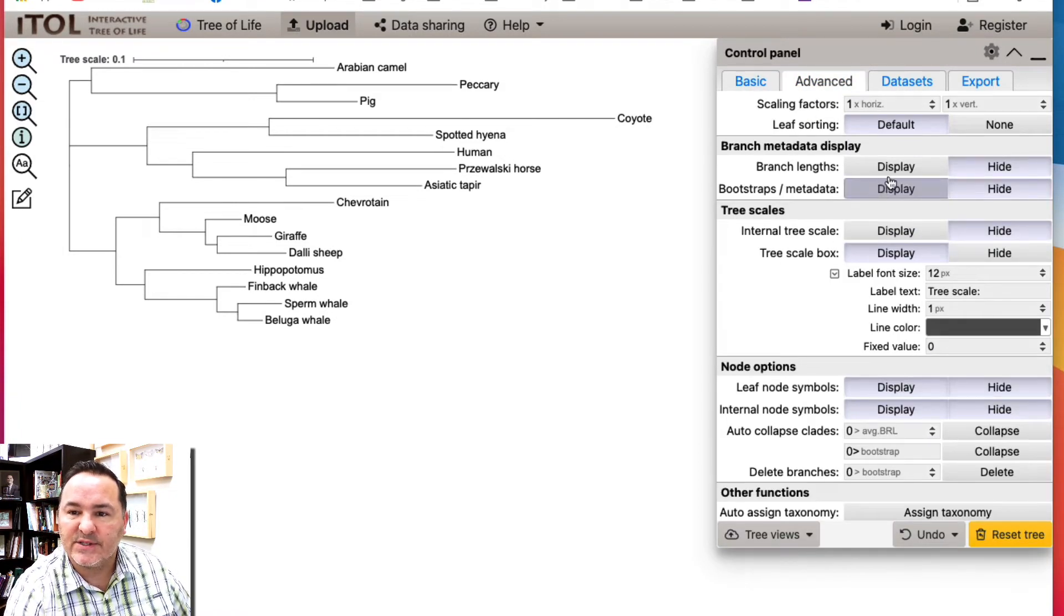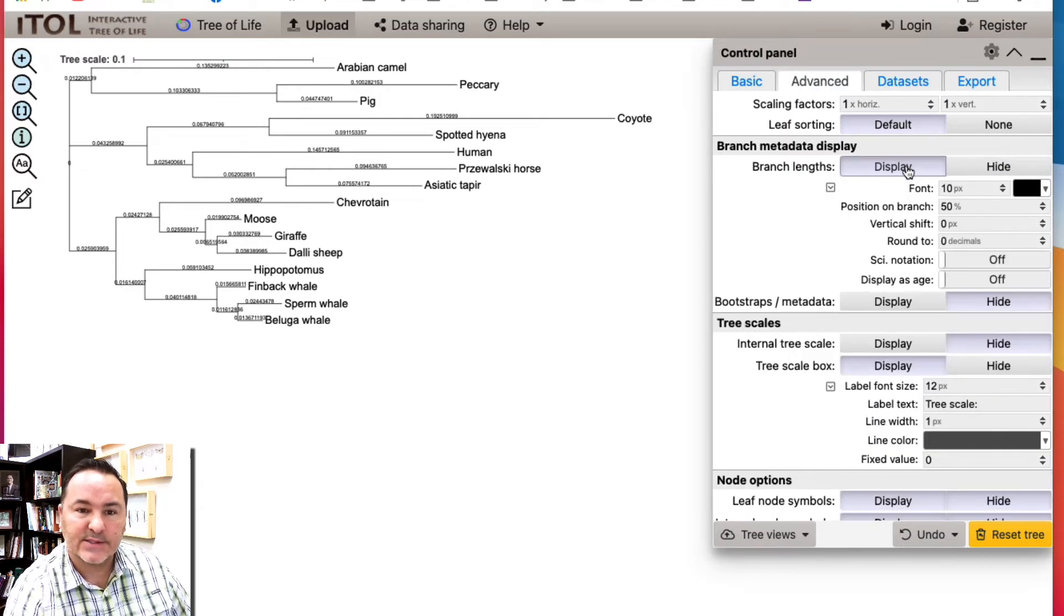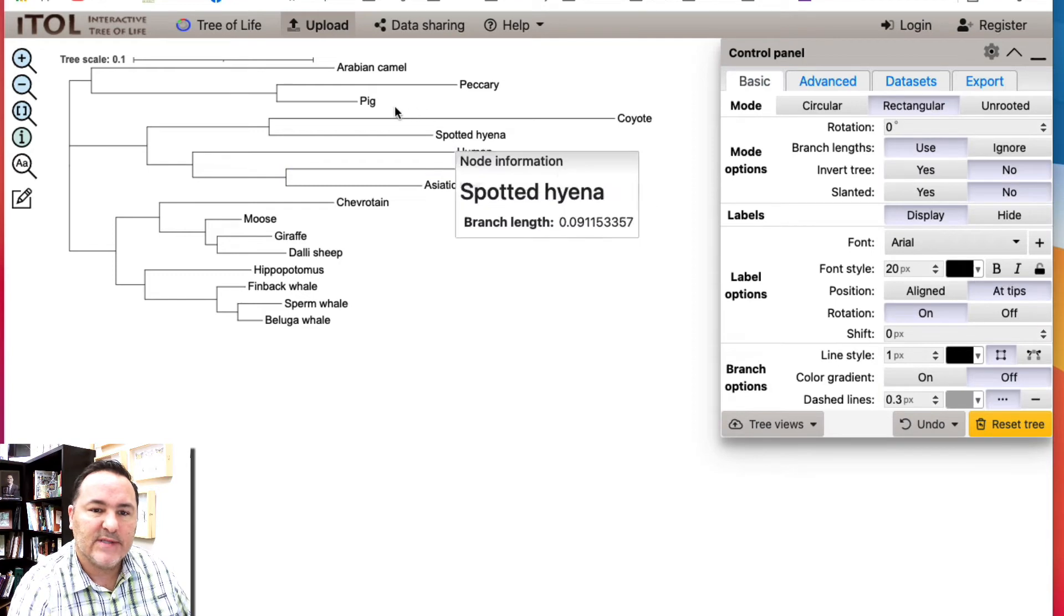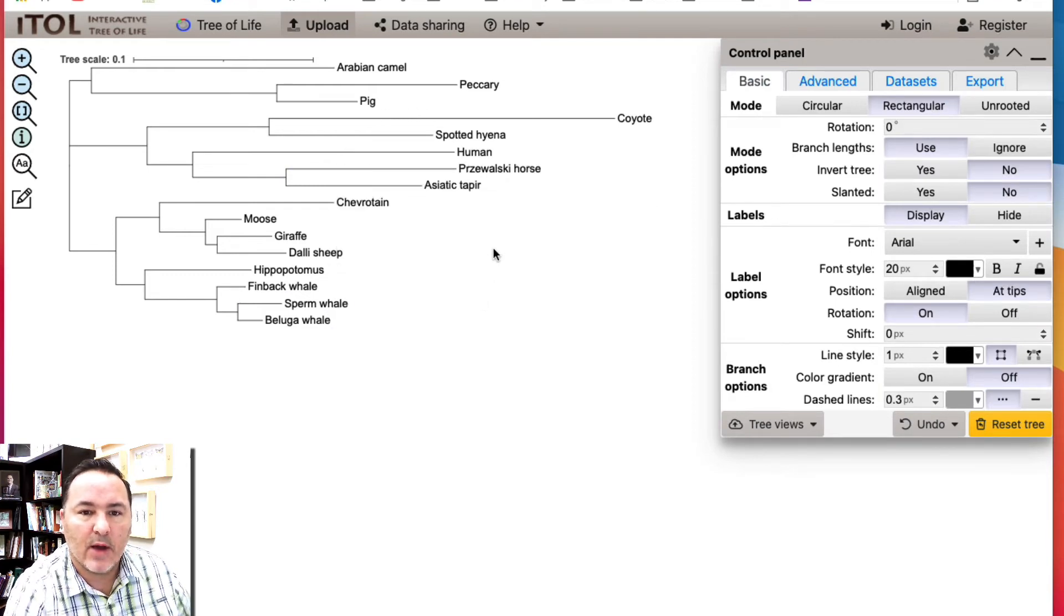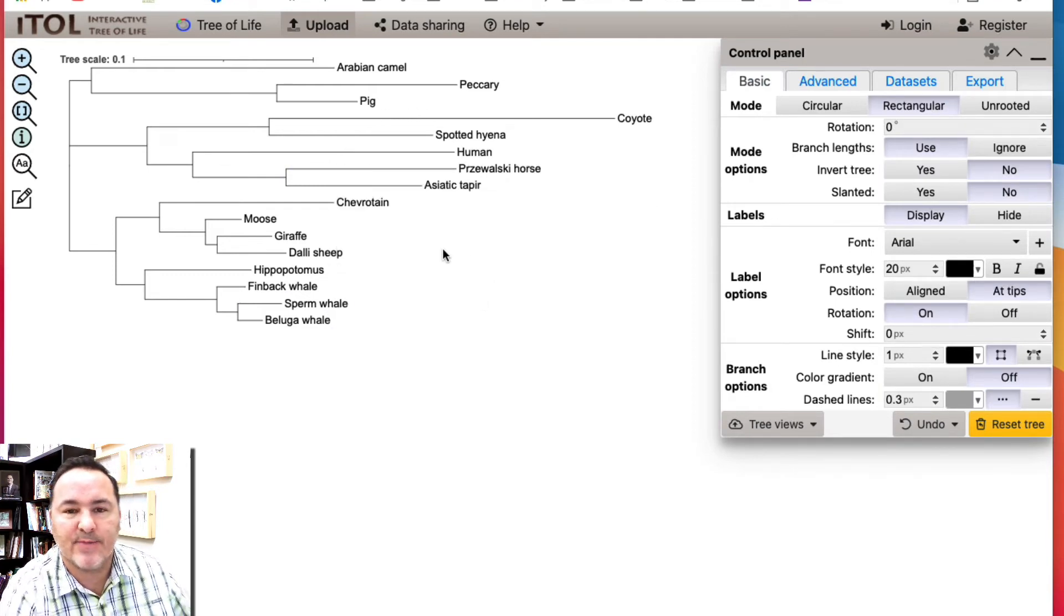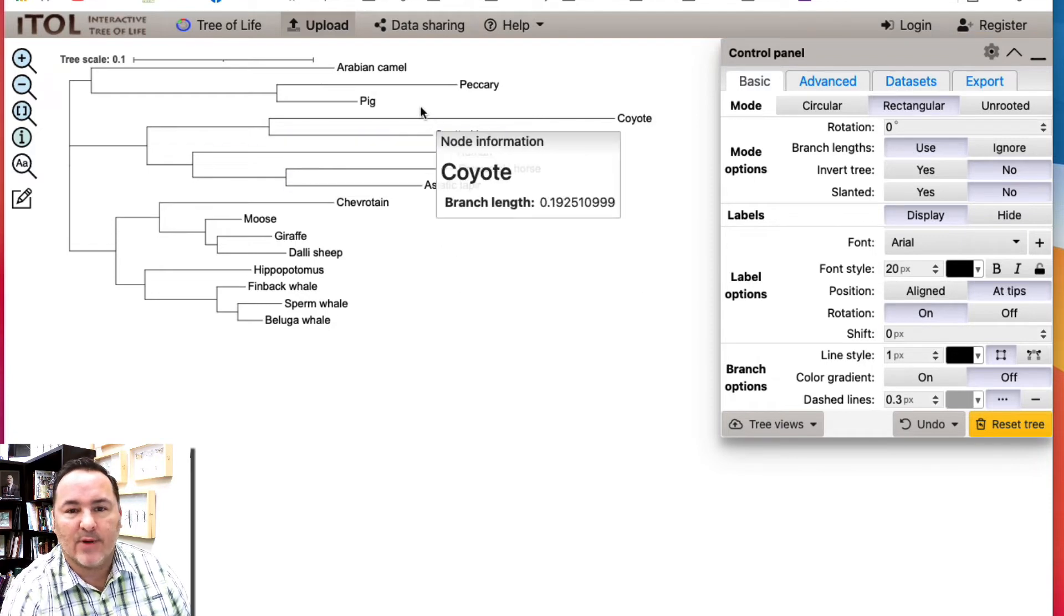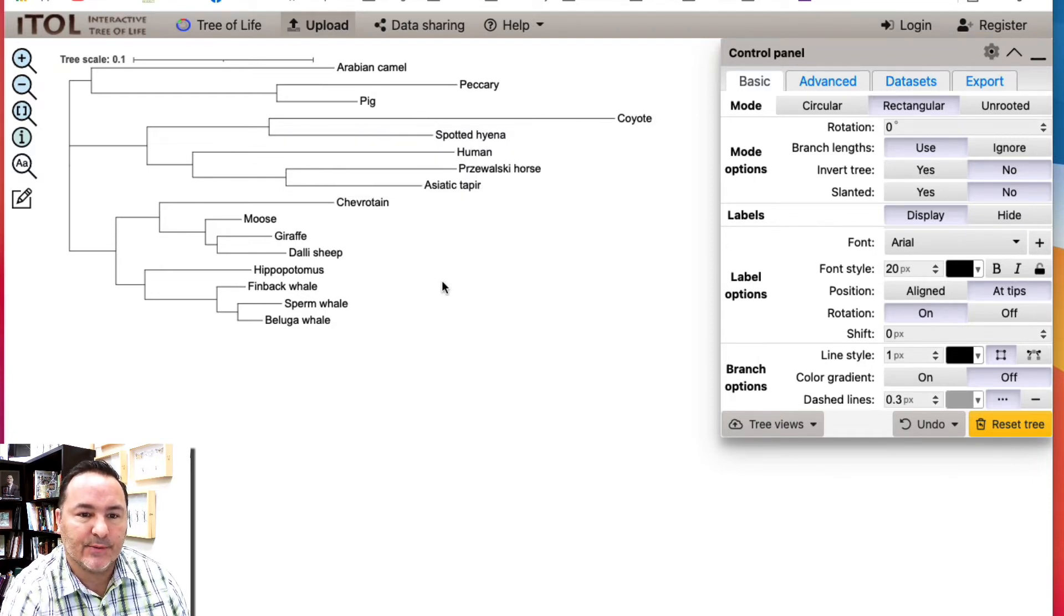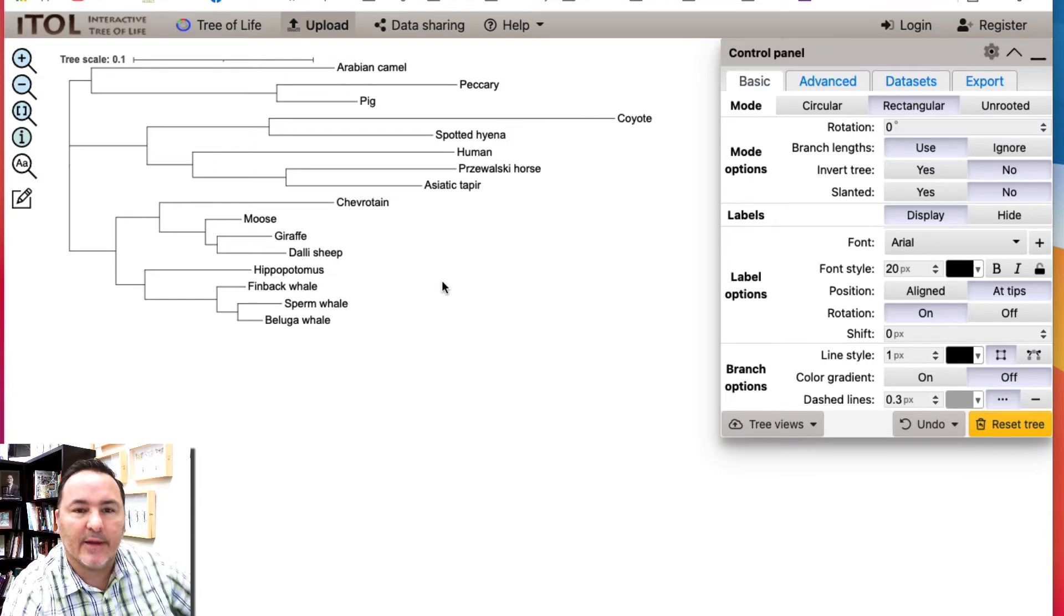We can display our branch lengths if we wanted. Let's say I look at this and I say, oh, I need to reroute this to my outgroup. Well, these are all just mammals here, all placental mammals. So maybe there's not a, probably this dataset would have been better had maybe I included a marsupial or something like that as an outgroup.